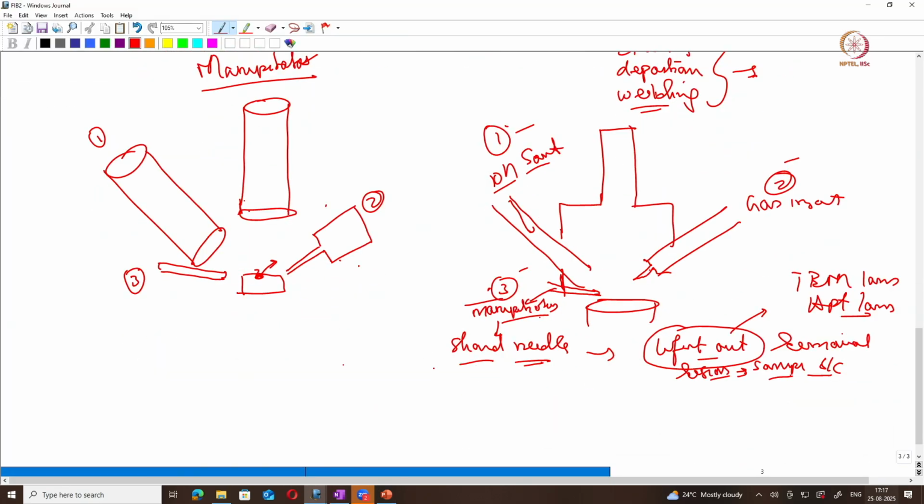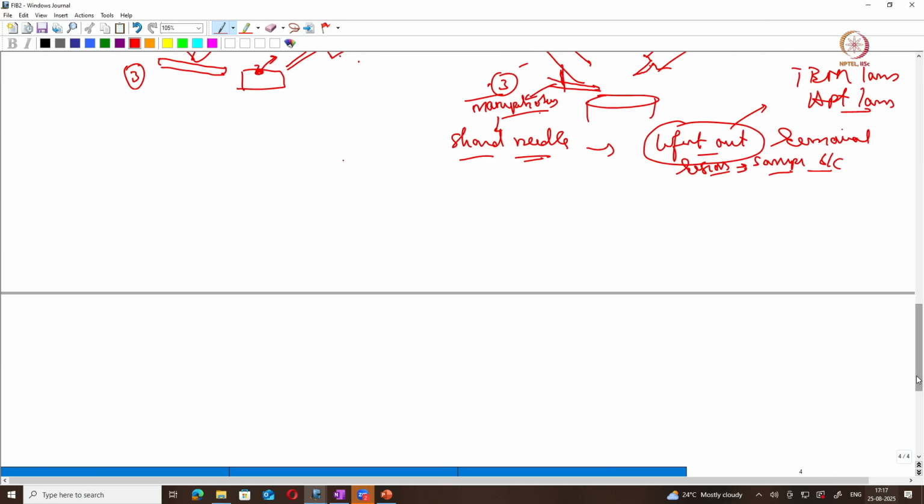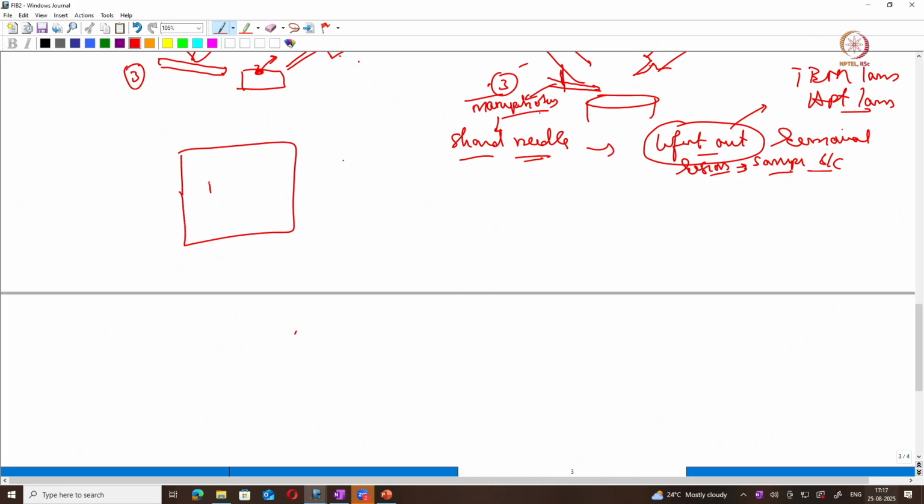Okay. Now, by using these ion beams, as I told you, in any material you can actually deposit platinum or carbon, okay, on the sample surface. So if you have a certain region of interest, then you can mark that particular region by platinum deposit or tungsten deposition on the region of interest. Okay, then you can do the cross section.